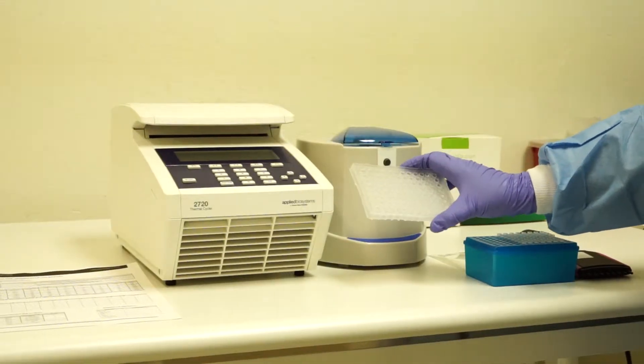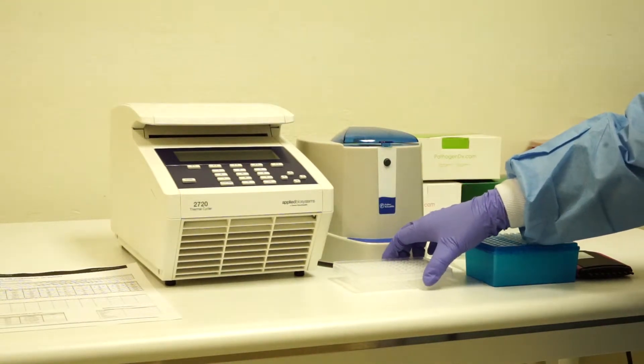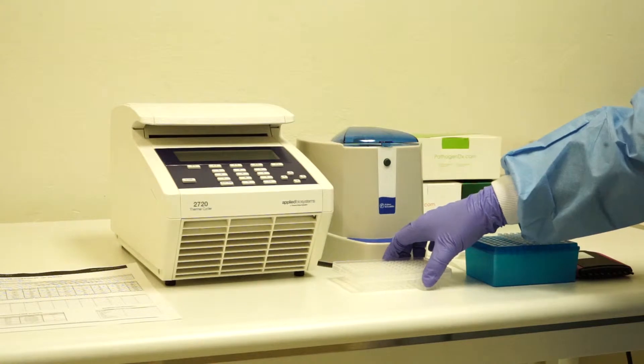Once you've plated your labeling PCR master mix, remove the plate from the PCR area and place in the post-PCR or hybridization area.